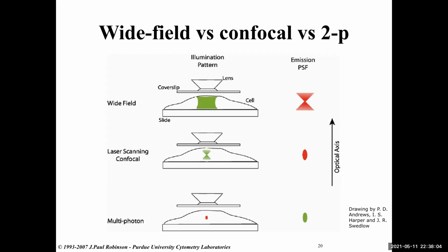And the multi-photon is really the champion of not bleaching your specimen, because you're only going to illuminate that one tiny area where the physics is happening and the photons are combining. You are shining a red laser. They never draw that. You're shining a red laser through the rest of it, but because it's so gentle, it's kind of okay.